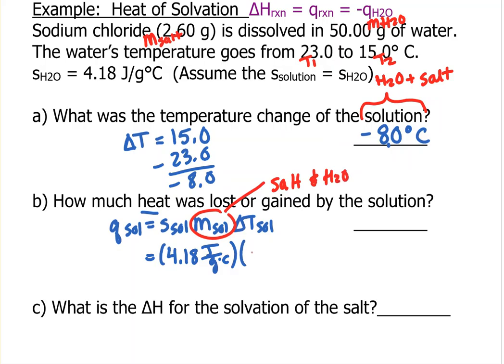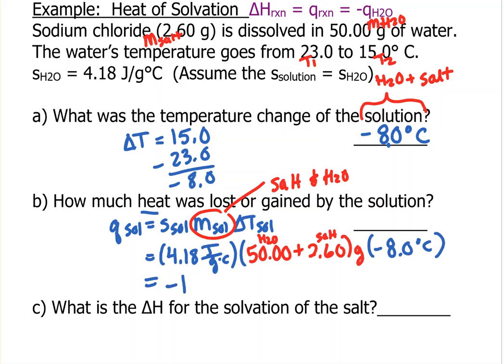So I'm going to plug in the 50, did those in a different order, but and the 2.60 grams. This is the water and the salt. Again, I'm going to keep a lot of digits here at first.